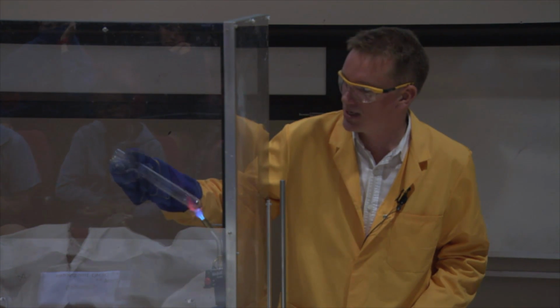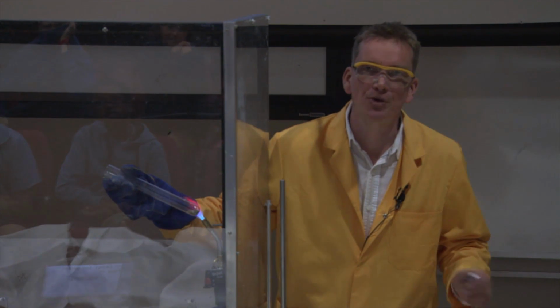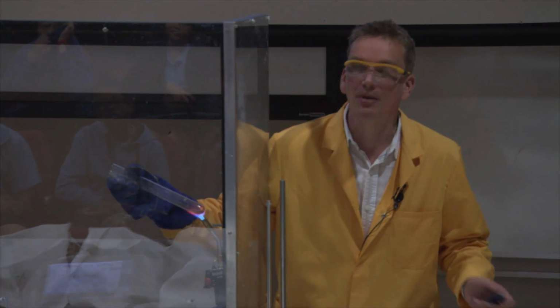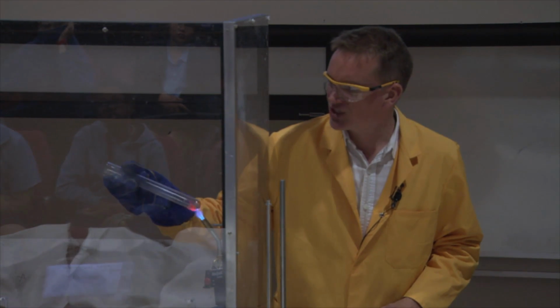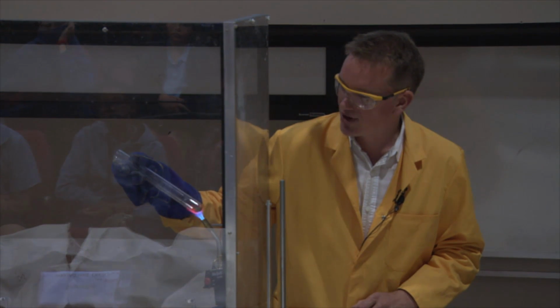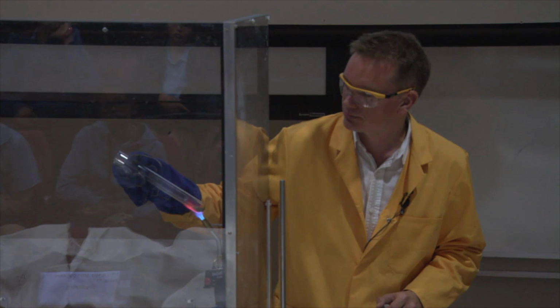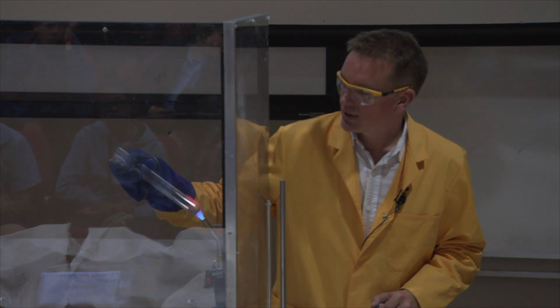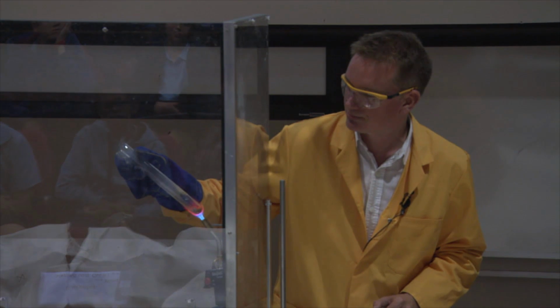little bit. Okay? So before, the 2 reactions that you've seen, where the iron combines with the oxygen or the iron combined with the sulfur, gave out a lot of energy. In this one, I need to put a lot of energy in. I'm just heating this up. It needs to be very, very hot. I need to heat it up to break the bonds that we have here. So I'm trying to break the chemical bonds between the iron and the sulfur. And I'm hoping that we might see some of the sulfur come out of this compound.